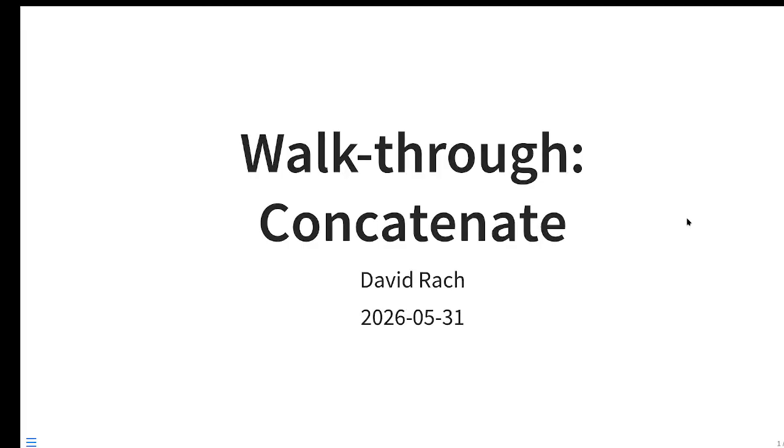So today we're doing one of our bonus walkthroughs, covering the more extensive version of the downsampling and concatenation lesson, specifically focusing in on the concatenate function, which had multiple moving pieces as well as multiple nested functions. So it was on our to-do list to record. Now that we're in the summer and I have a little bit more additional time, I'm just going to go ahead and go through these different recordings, make sure I get all the videos so that they can be posted alongside the website.